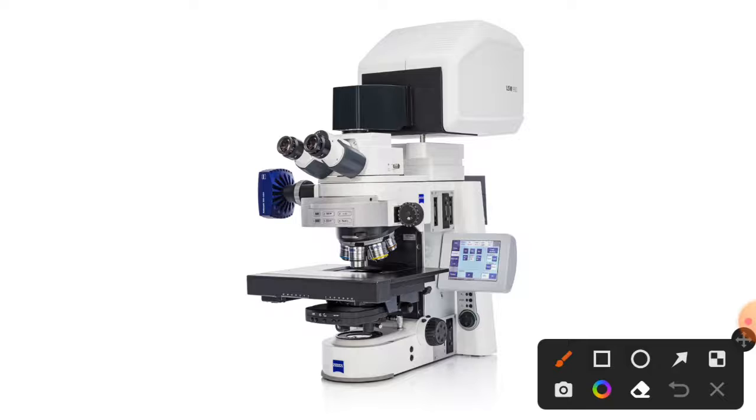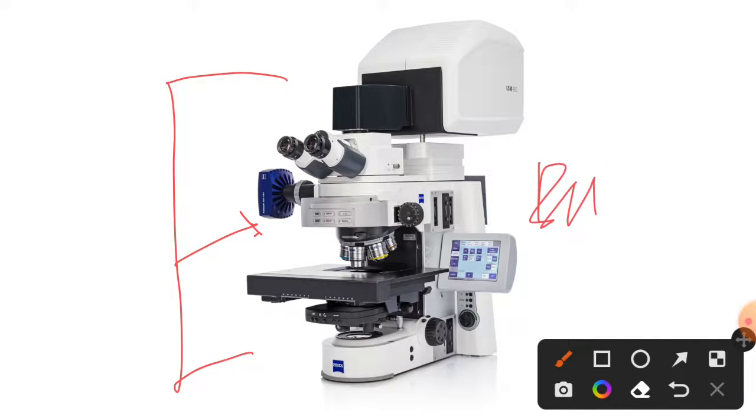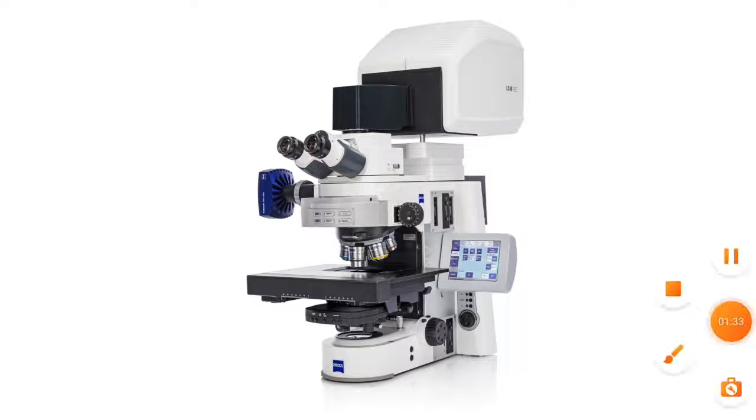So now scientists developed another type of microscopic technique known as confocal microscopy, that will not only provide a bright and good image of the 3D specimen, it will also provide you the 3D image of the specimen. So let's discuss it.